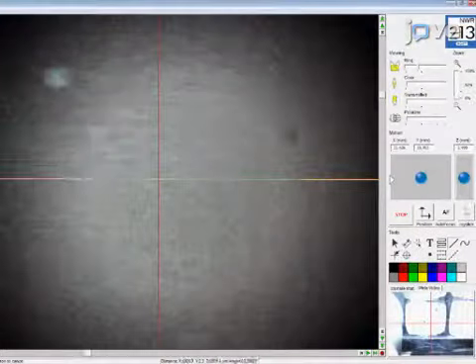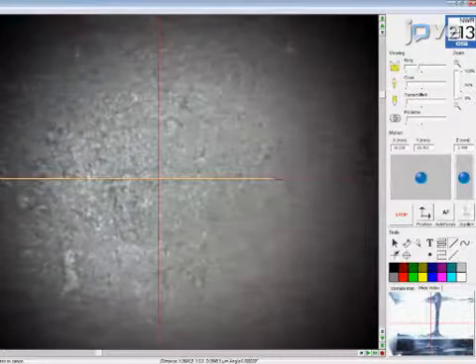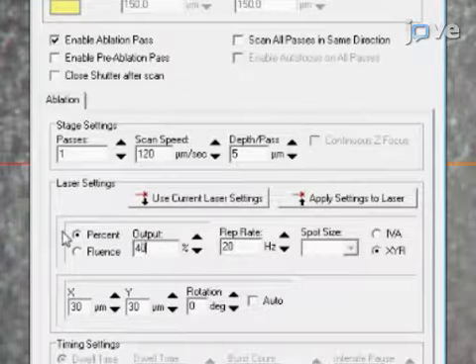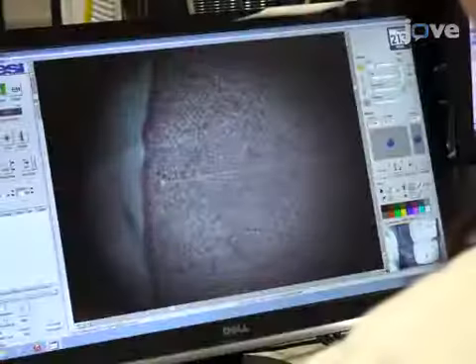While the instrument is warming up, in the laser ablation software, draw a line of ablation approximately 3 mm long across the surface of the first tissue standard. Click the line of ablation and set the default beam diameter, the scan speed, and the radiant fluence. Duplicate the line 6 times, spacing the lines apart by the beam diameter. Repeat this process for each standard.